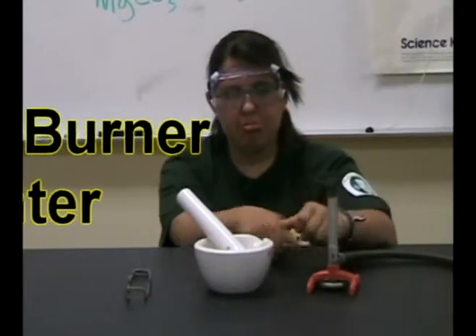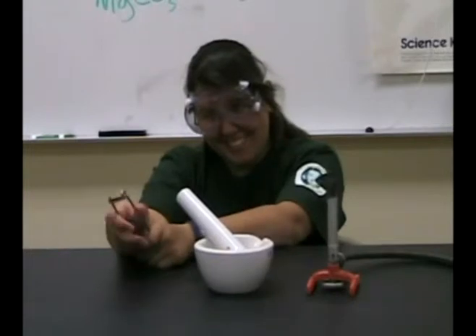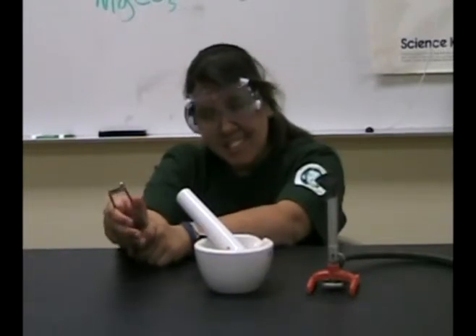Bunsen burner lighter. These are used specifically for lighting Bunsen burners. They may look like cool sparklers, but they aren't.